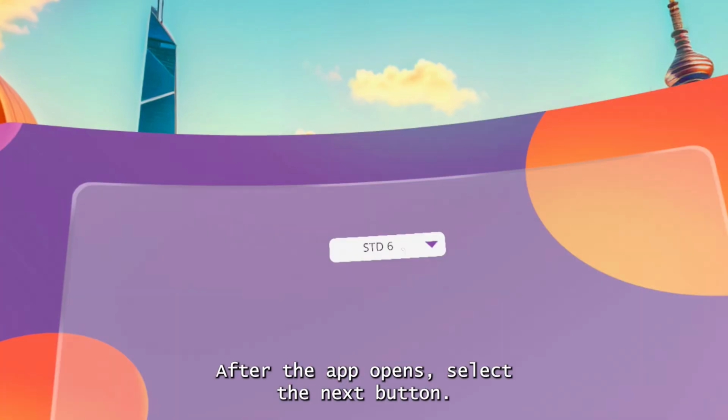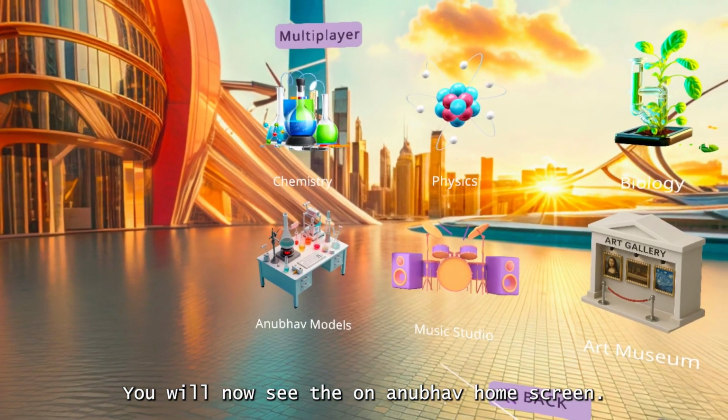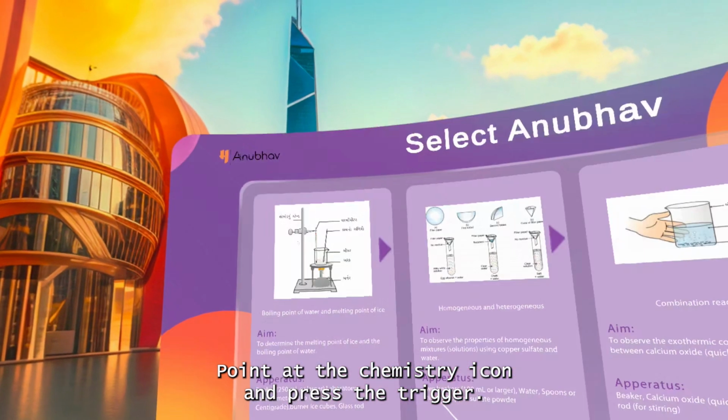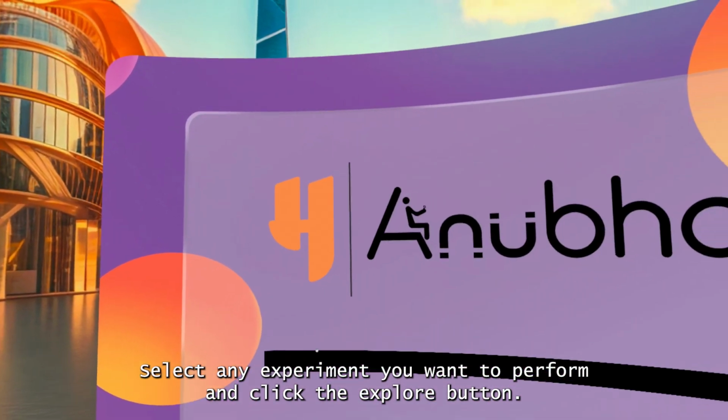After the app opens, select the Next button. You will now see the Anubhav home screen. Point at the chemistry icon and press the trigger. Select any experiment you want to perform and click the Explore button.